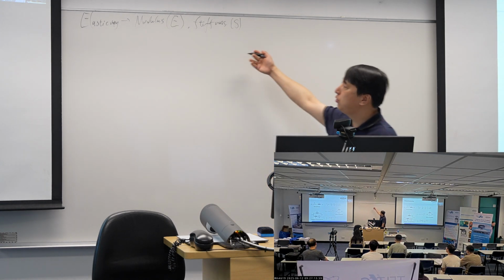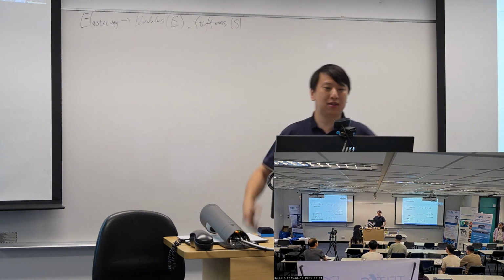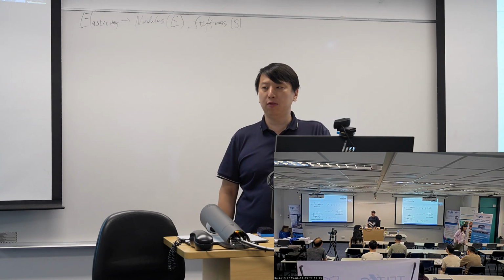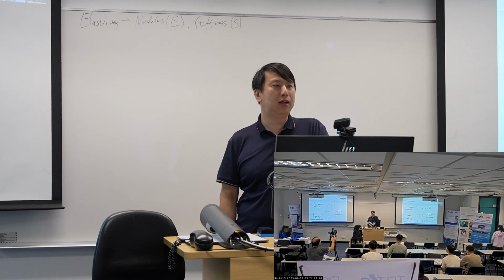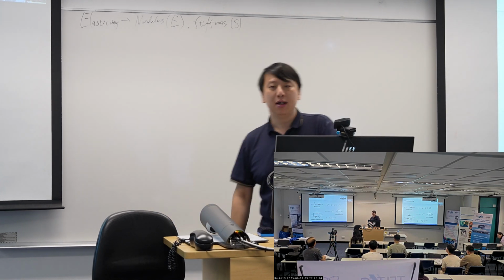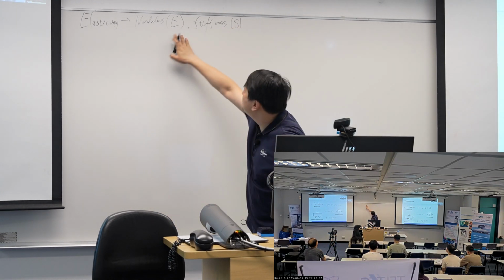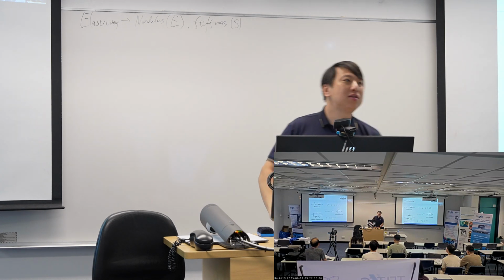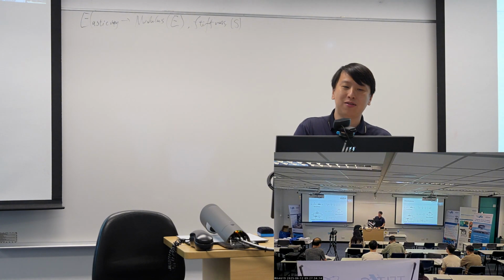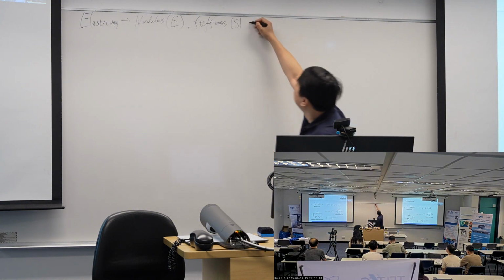A larger modulus or larger stiffness means the sample is harder. But for polymers, gels, or cells, they found the modulus or stiffness is not always a constant.